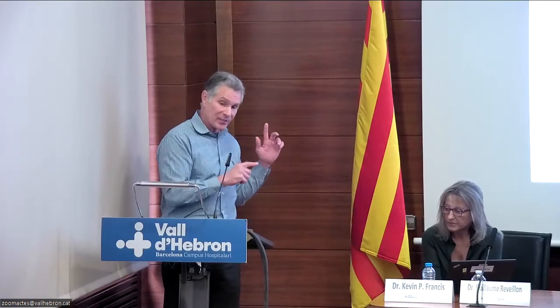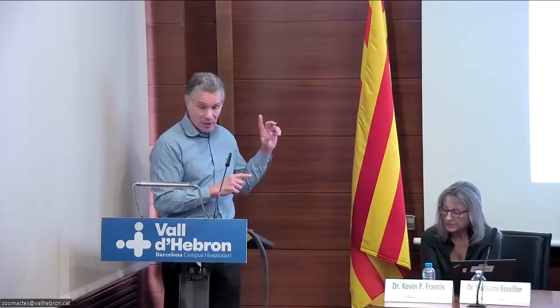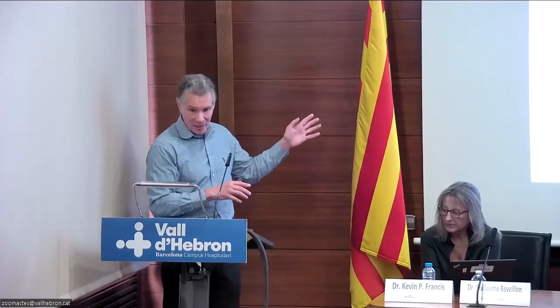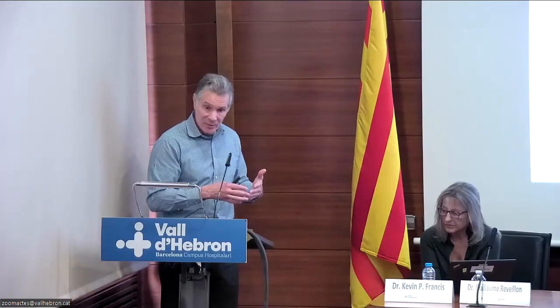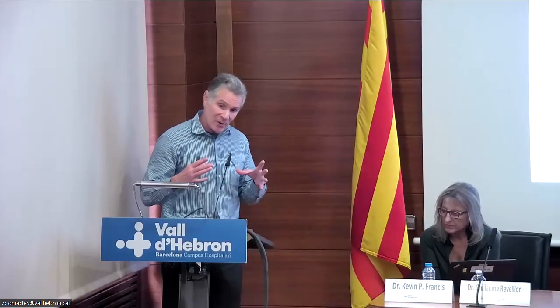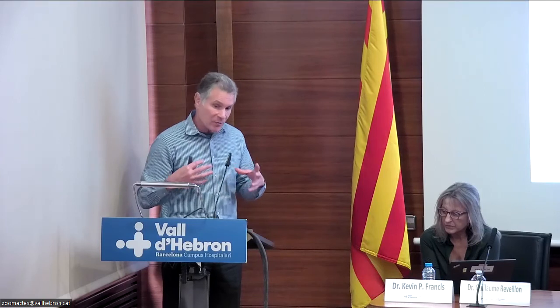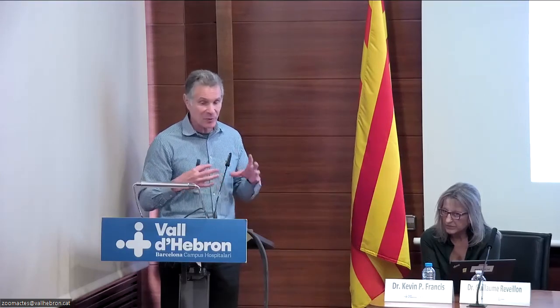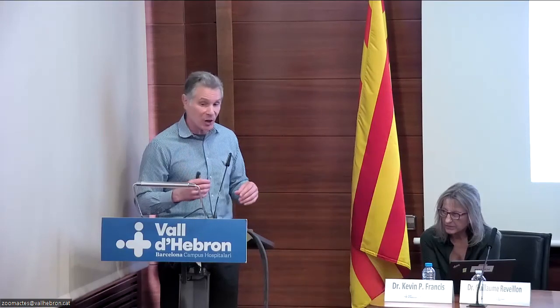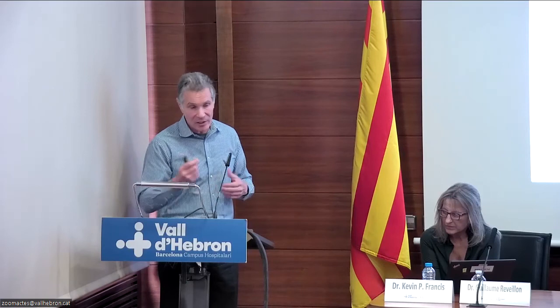However, because they had so much light being produced, they used an ICCD or an EMCCD. I think it was actually an EMCCD, which is an electron-multiplying CCD system. By doing that, they've got a camera that continuously gives you a readout. It's not quite as sensitive, but it's still pretty good. So they would have used that camera on this. It's very similar to our cameras, but it's basically putting the marmoset in a dark room and using this camera externally. So that can be done.